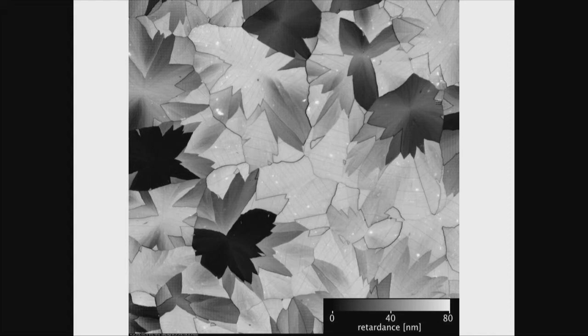If we had polarizers here, and you look down the obtuse angle of a calcite crystal, it is not birefringent. But if you look perpendicular to this angle or at any other angle, then it is birefringent. And so the crystal here, for example, seems to have no retardance, no birefringence, whereas others are more highly birefringent, others are in between. So what's happening here?